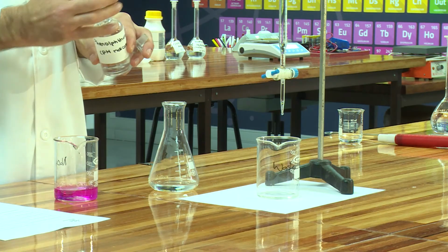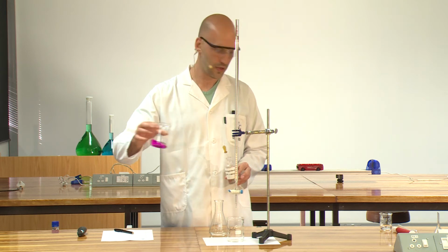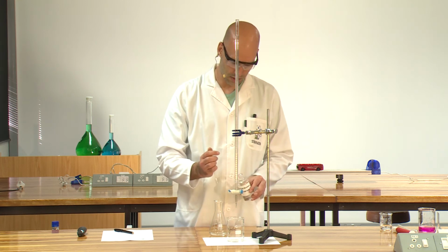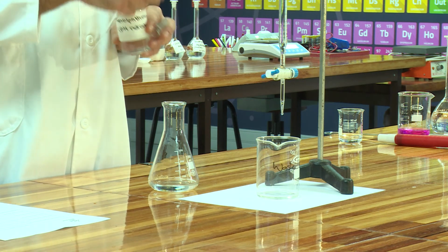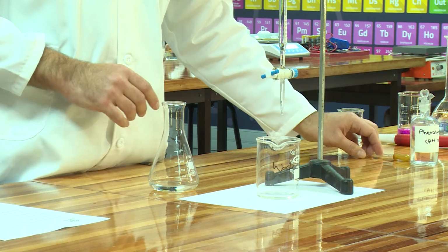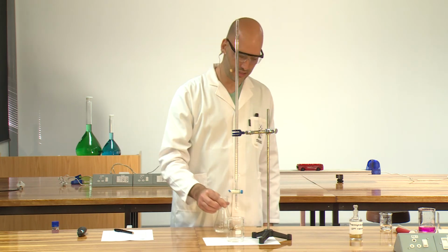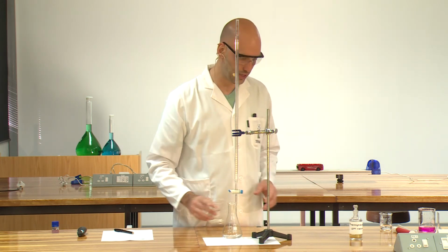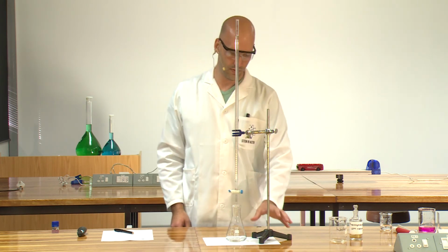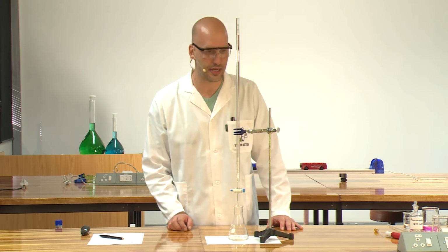You see, you don't even have to add a lot of drops. And you will see that the base will change to a color. Okay, so that's the color that it will be. So you just add 1, 2 drops. That's the only thing we need. And you can just move that to the side. So then we know that we've got our oxalic acid and our indicator in here. Okay, so we can take the waste beaker away and we can put our conical flask in there with our unknown solution. Now everything is set up and we can go ahead and do the titration.